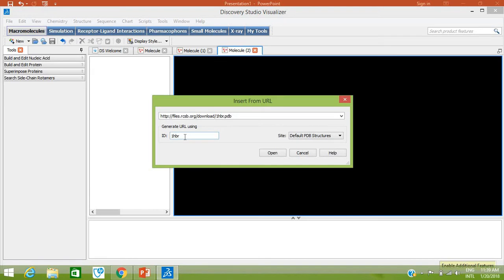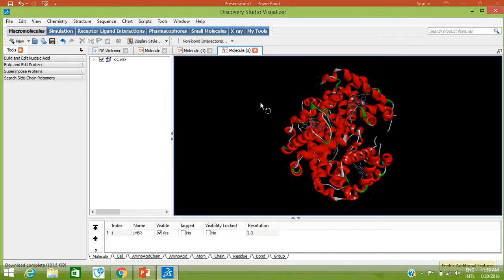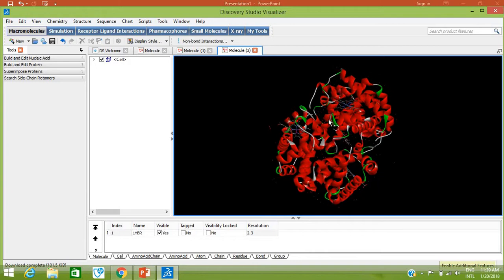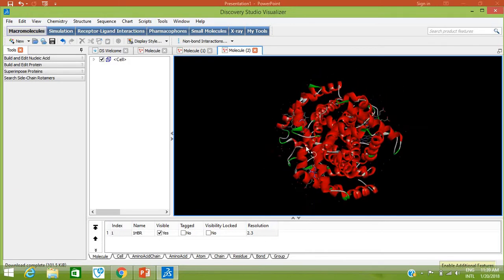Open another new Molecule Window, then let's import a protein. Change the type to PDB Structure, type 1HBR which is chicken hemoglobin, and click Open. Your chicken hemoglobin has been imported into the newly opened window.